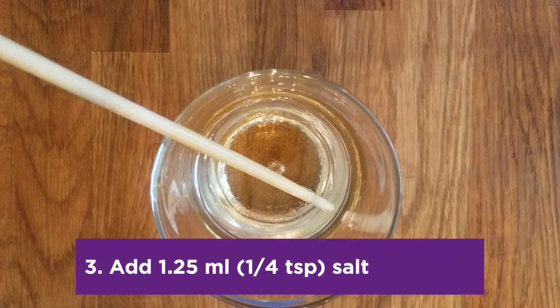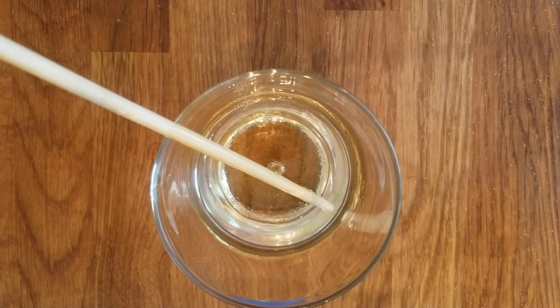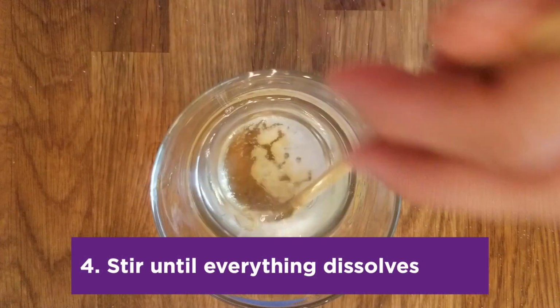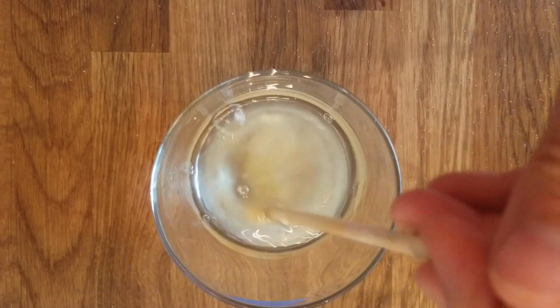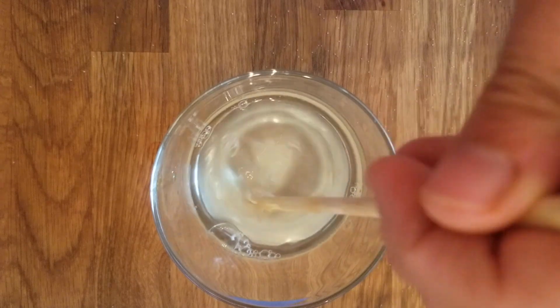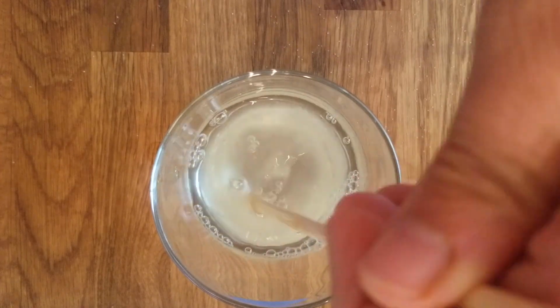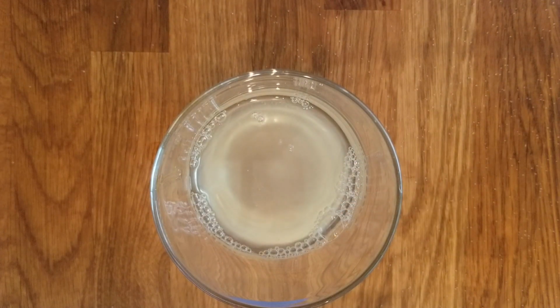So you need to add 1/4 teaspoon of salt. Just regular table salt, nothing fancy. You can add that. Then you want to stir these until they dissolve. Now, you don't want to stir it so much that you get lots and lots of foam, but you do need to stir it until all of that salt is dissolved in the liquid. And it'll take just a little bit. You can see mine's already starting to get all dissolved. Okay, you've made your extraction liquid.